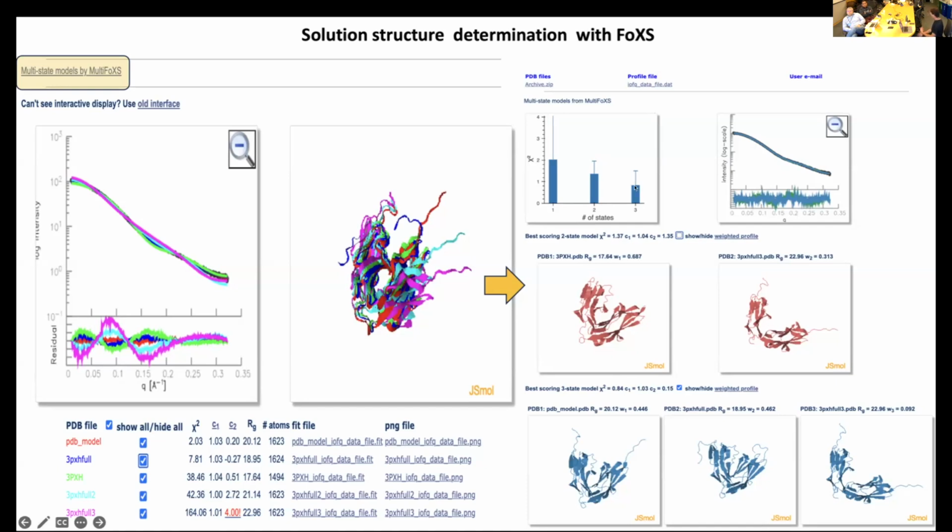So how simply this goes: AlphaFold can now produce lots of different models on the web, or you have something already crystallized. I recommend still using AlphaFold because in crystallized structures you're missing parts. You're missing your histags, you're missing your loops. Here, if you do some prediction, they're going to be almost the same in our resolution as your crystal structure, but it will add those histags, like you can see here, that matter a lot. Full structures are important for our modeling.